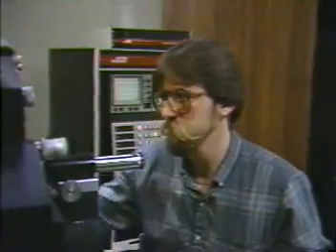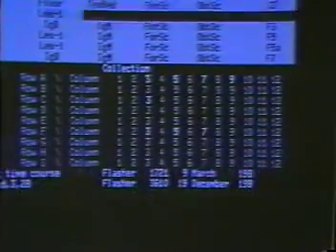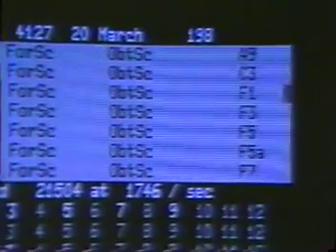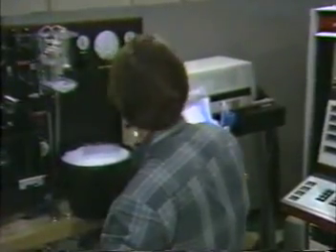Each time Keith delivers a sample to the FACS, he presses a key on the terminal so that FACS Desk will begin collecting data. You don't need to know anything about computers to run FACS Desk. Every function can be called up with simple 1 or 2 keystroke commands. The step-by-step tutorials in the second portion of this presentation will detail the use of each command and explain how to interpret the information shown on the terminal screen.